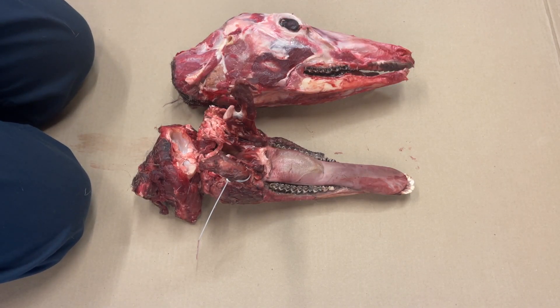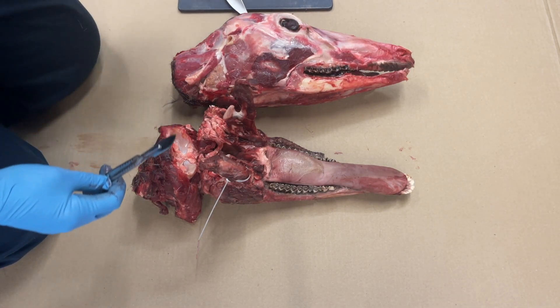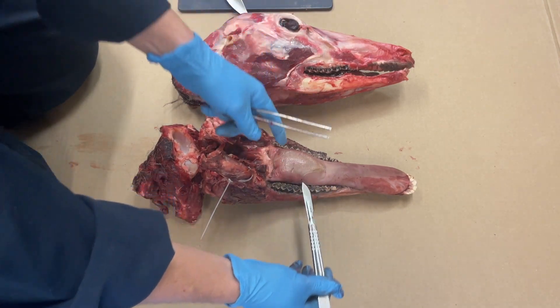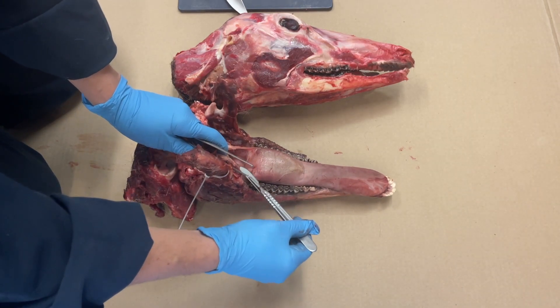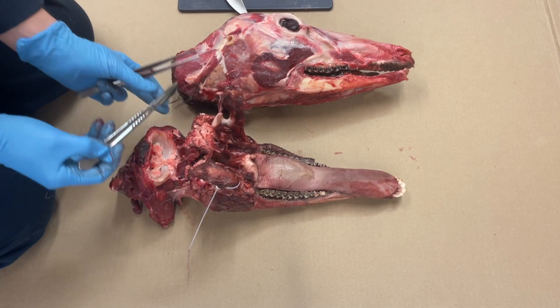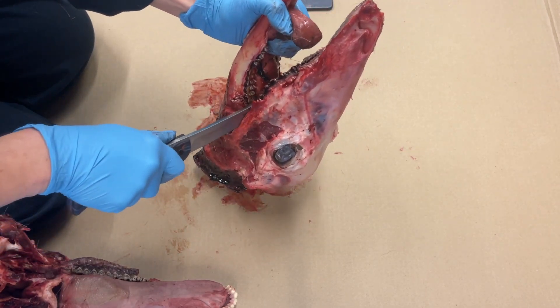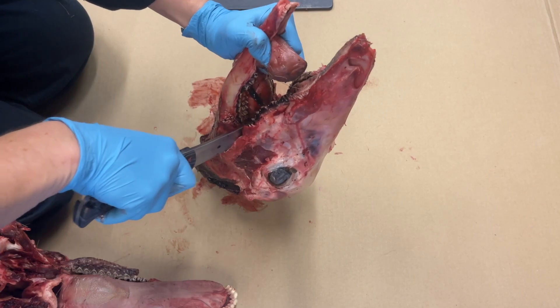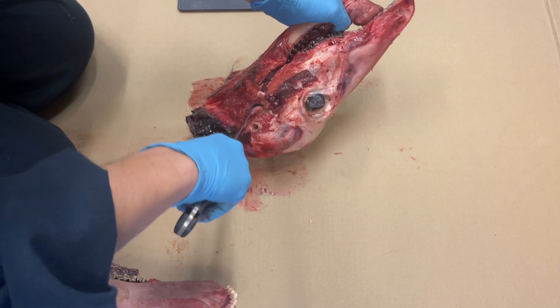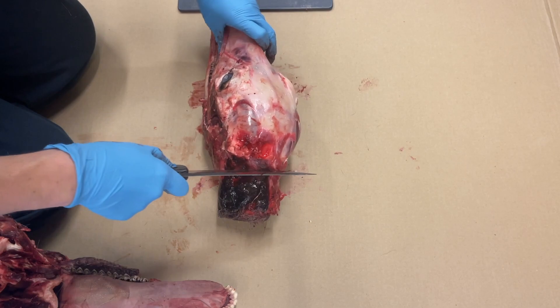This demonstration shows how to remove the lower jaw if the hunter wants to keep the top of the skull for a European mount. All the tissues needed for chronic wasting disease testing are located at the back of the throat — the tonsils are located here and the retropharyngeal lymph nodes are located back here. Begin by using a knife to cut along the bone of the lower jaw, as close to the bone as possible. Follow the arch of the lower jaw bone cutting up towards the skull, then cut along the base of the skull to detach the last vertebrae at the back.